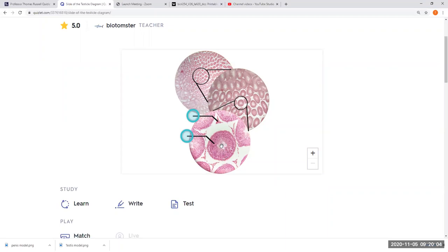By the time they reach the middle of the tube, the special cells in here, which we can't identify, called the Sertoli cells, hold them in place until they grow tails, and they can then swim down the tube. So this is where sperm production takes place, spermatogenesis. On the outside of the tube is where the interstitial endocrinocytes, or the interstitial cells of Leydig, are. So that's what these cells are, and these cells and those cells produce testosterone. So that's where testosterone comes from.